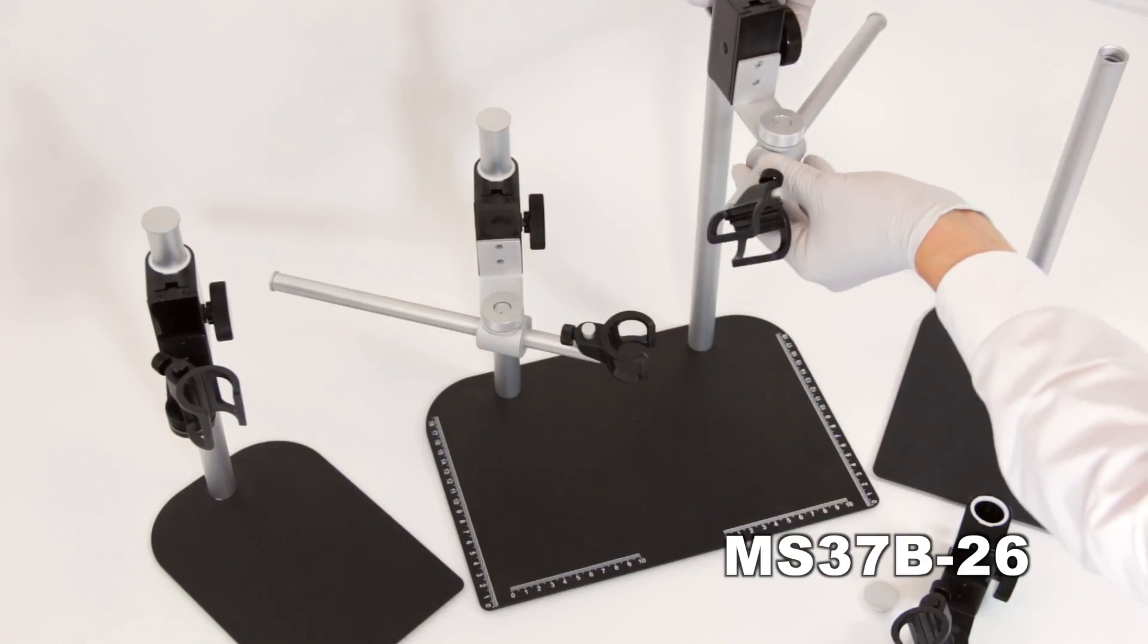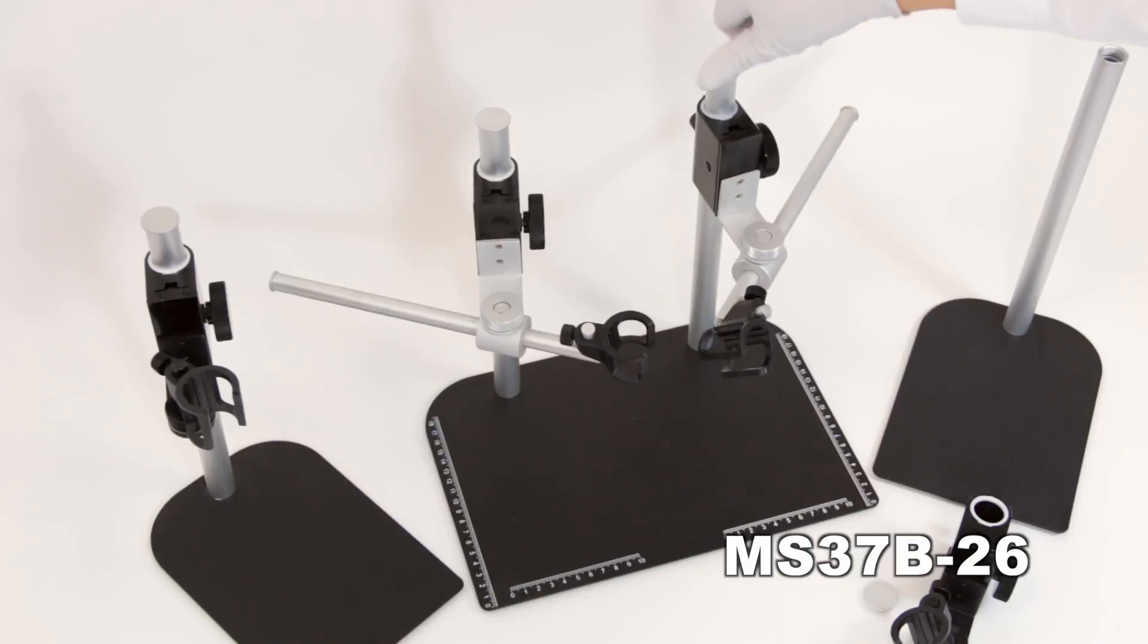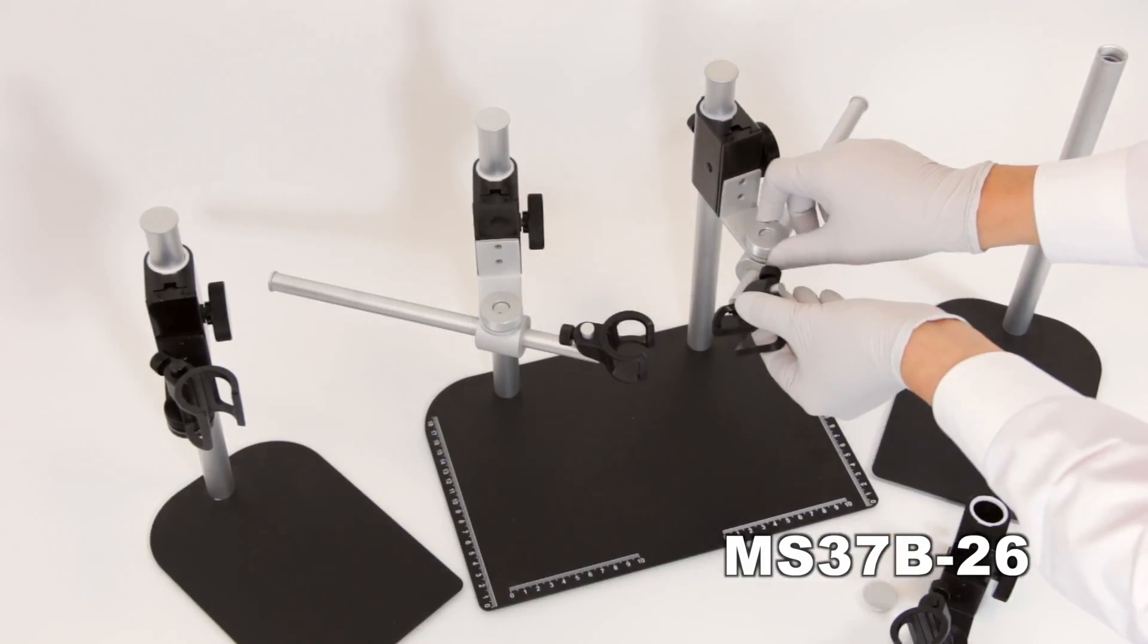MS37B26 includes two adjustable boom arm blocks with fine adjustment for greater area viewing range and larger objects.